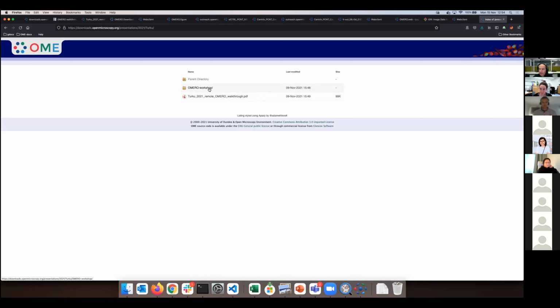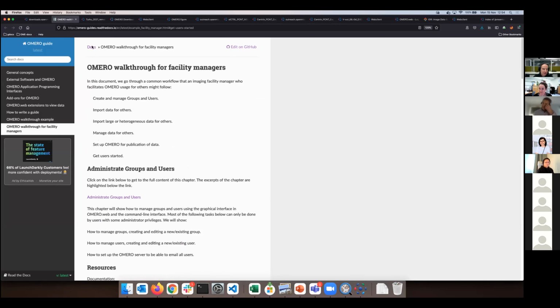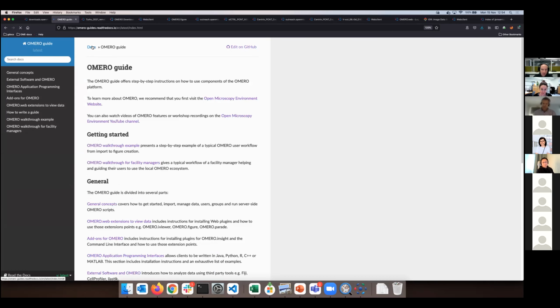As well as you can forget all of that and just say, I just want OMERO guides. That's also a way to work. Okay, what is the advantage of simply sticking to OMERO guides? Well, you get a new world, basically another dimension. Of course, the OMERO guides were not written specifically with this workshop in mind.